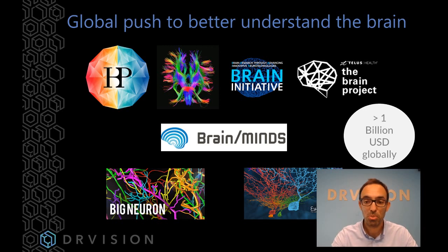And there is a very interesting project led by Hanchuan Peng here in Seattle. He's based at the Allen Institute, called the BigNeuron. You should check it out. It looks very, very interesting, where they test a huge range of automatic neuron tracing algorithms, and from there we can also learn about which algorithms work best and which approaches work best, and then we implement those in Aivia. So that's the BigNeuron.